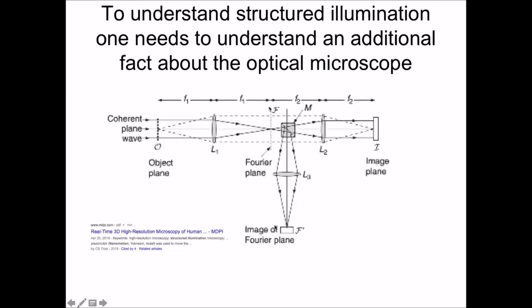That means it's not an image, it's a distribution of interferences, okay? That distribution of interferences actually undergoes a Fourier transform with this lens, which is the tube lens, to make the image that you see. And when the tube lens does that, it gets rid of all the phases. At this point, you have the phases of light, because you have how the interference of one ray is interfering with another ray, which is due to the exponential component of the electromagnetic field of the light, okay?